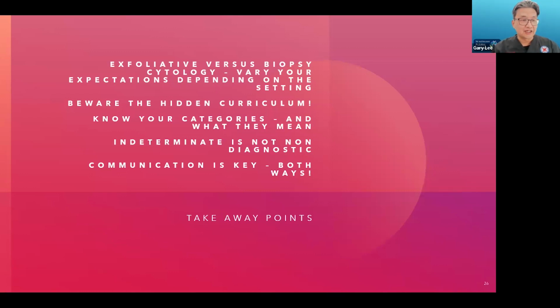And this is something that I only just realized very recently, that not every hospital would actually look at all the biopsies we have taken. And a lot of times they only cut a certain number of slides from the paraffin block. Is that true? Not for biopsies, but certainly for excisions. So biopsy specimens, if they're core biopsies, we submit all of them and we look at them often at multiple levels. If you excise a lung, obviously there's no way to process a whole lung in 5-micron sections.